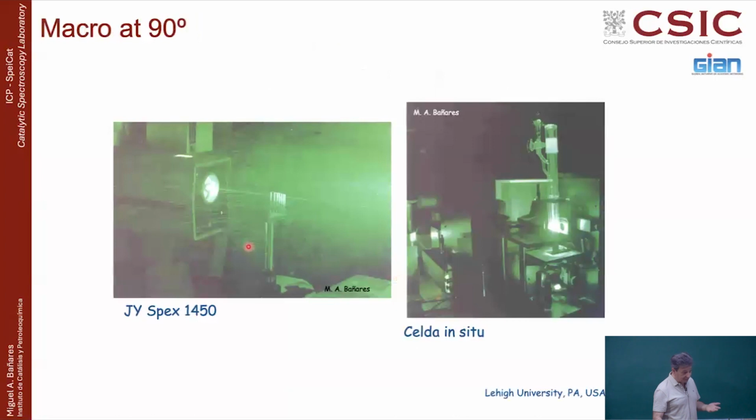This is when I was at Lehigh, and probably Sagar has seen those things, the way I was working. So we were using a big laser, and we were using this in situ cell where you put the platelet like that, and then you have to orientate. That was an in situ cell where you control the atmosphere, you have made temperature treatments, and then you have to play and orientate and wait 20 minutes to see if the spectrum was made. So I was making a lot of photos with a high exposure time that look great.